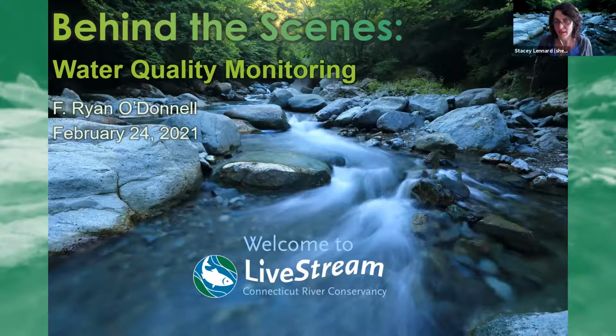For today's presentation, this behind the scenes look at CRC's water quality monitoring program will be guided by Ryan O'Donnell, CRC's water quality monitoring coordinator, who's been leading this charge since 2013. We'll learn more about river pollution like bacteria, nutrients, and plastic, how CRC tests for it, and what we do with the data. Ryan will review the 2020 monitoring season, including Samplepalooza, our one-day 4-state nutrient monitoring event. And he'll give us a sneak peek into our new Microplastics monitoring program, which is very exciting.